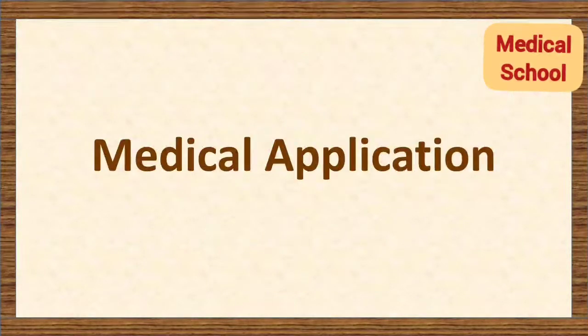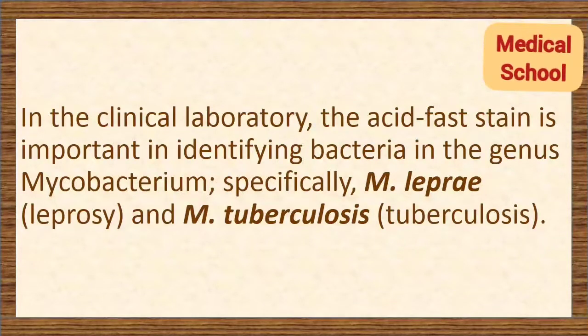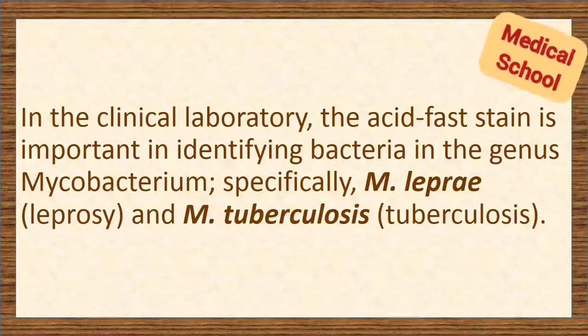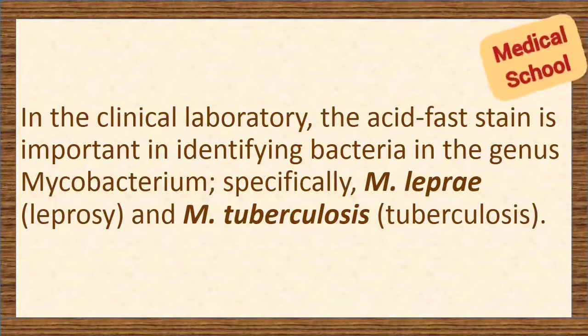Medical application. In the clinical laboratory, the acid-fast stain is important in identifying bacteria in the genus Mycobacterium, specifically M. leprae, which causes leprosy, and M. tuberculosis, which is the causative agent of tuberculosis.